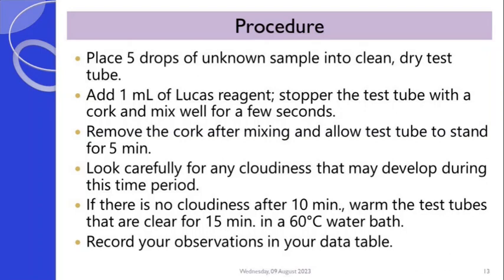Observe closely if you would be able to see any form of cloudiness that is likely to develop during this time period.